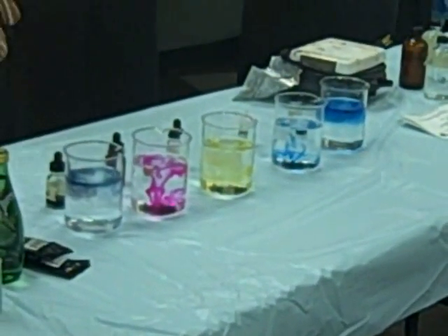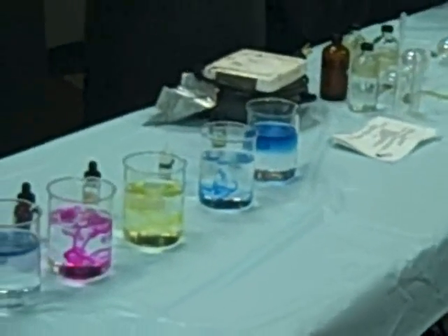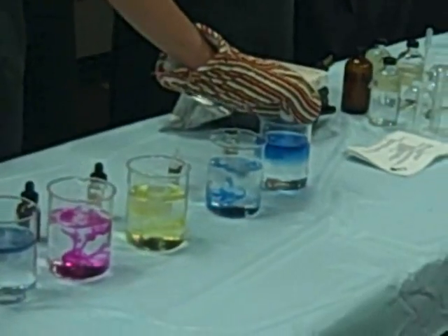And then I'm going to put a piece of dry ice in each one, and the dry ice will react with the hydrogen and water in the water, and should change colors, because then the solution will be acidic instead of basic.